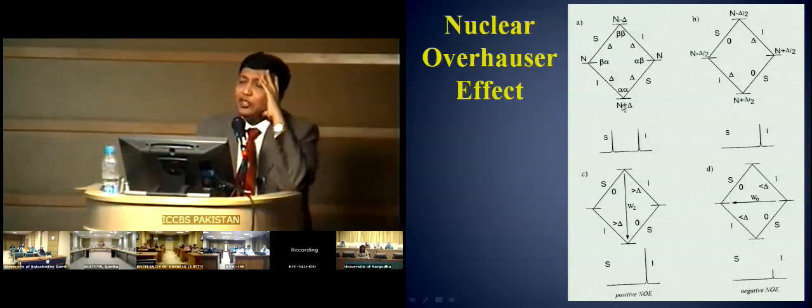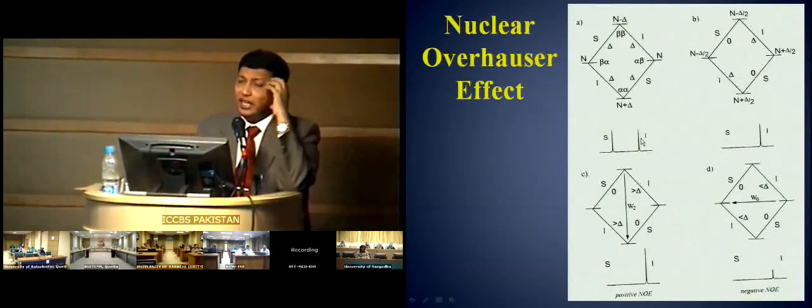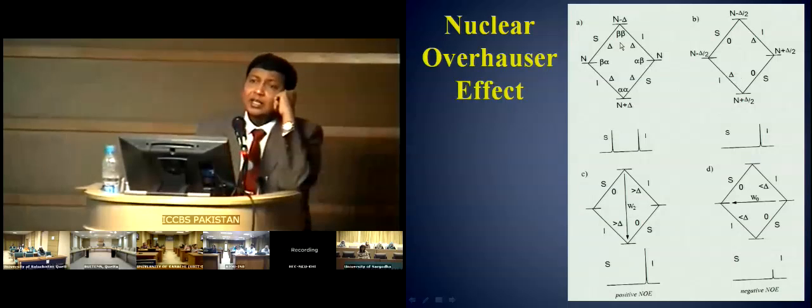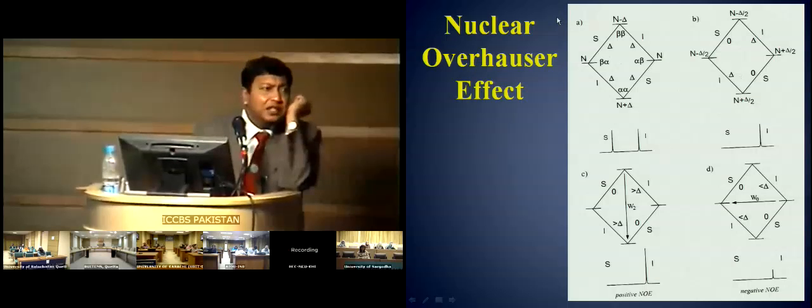Very easy. The difference between S and I, this is an S transition. Remember, this is an S transition, right? So the difference is only delta, right? In this, the difference is delta. So you see S and I appearing as singlets. Kindly remember that they are not close enough to cause any splitting of signal. They are not scalar coupled.